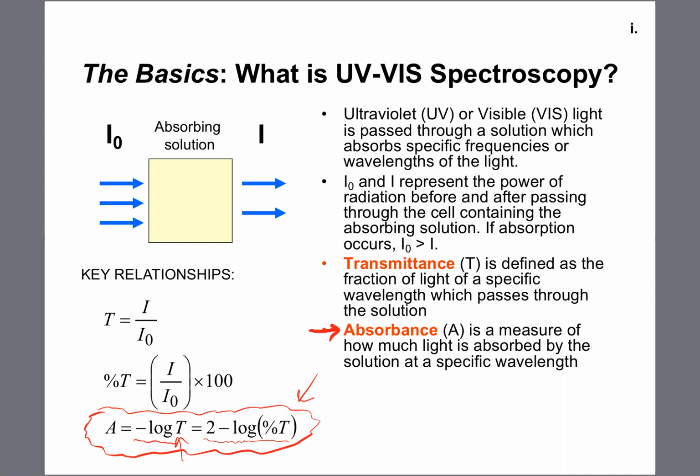So if we know the transmittance, I can compute the absorbance. All right, and that's an important skill. Actually, I'll give you some sample problems in your quiz today as well that require you to do that. And you could expect to see that type of thing on your next exam, interconversion between absorbance and transmittance.